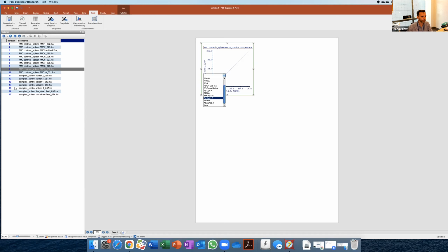So it might not even be the right fluorochrome that's being used, but it's just the name of the channel, right? And actually, in this file, we do have the names, so it was labeled, and this is nice because now we can see better that, okay, we have Ki67, CD44, CD25. It would be nice to see both, which is possible, but at least like this, it helps us during the analysis because you may not remember, and even for this demo, it's easier for you to remember what's a CD4 and CD8 than what APC or APC-Cy7 is labeling, right? So we'll start with this file and then we'll explore everything else.